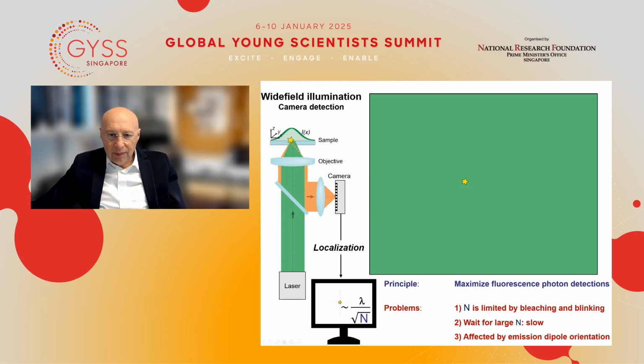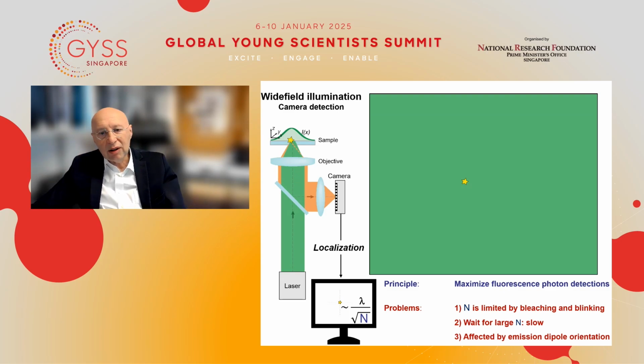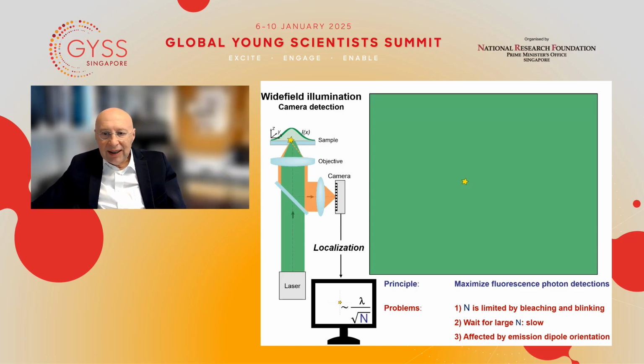And that kind of leads to a shift of the pattern in position, meaning that while we may locate the maximum of this fluorescent spot at a certain location, the actual position of the molecule is shifted to the side, because the pattern is actually not where it should be because of the orientation of the molecule. And that can easily amount to 5 nanometers, 10 nanometers, 20 nanometers. And then while you may get a very high precision, about a nanometer, in the number that you get, it may be the wrong number because the molecule actually is shifted to the side.